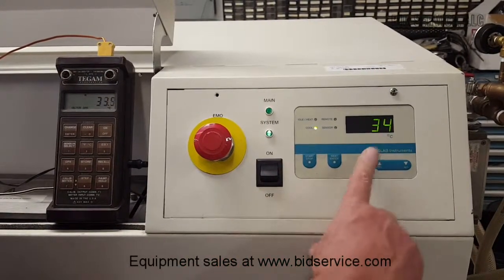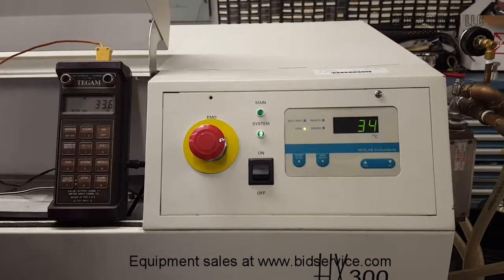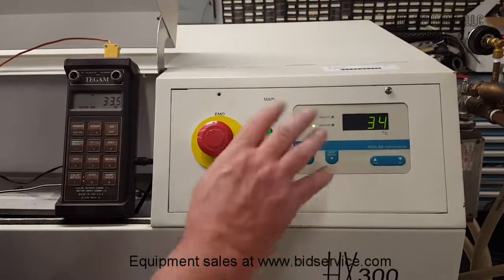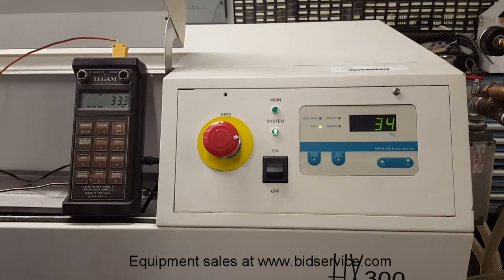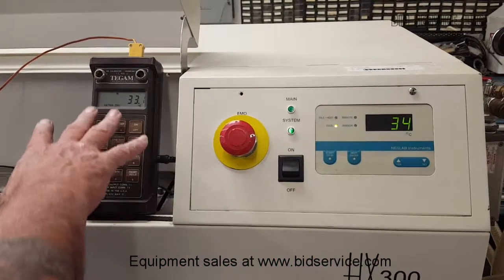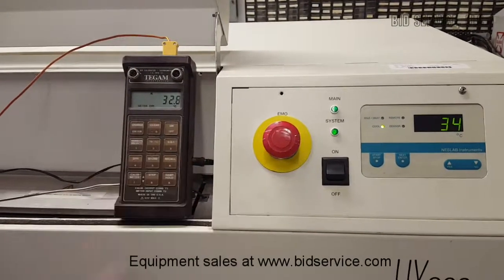As the temperature begins to drop you can see we are at 34. As it goes down it will go down to about 5 degrees. So we are going to wait until that happens and then come back and I can show you that it has gone down and we will compare it. And as you can see here on the separate meter, the temperature is already dropping.